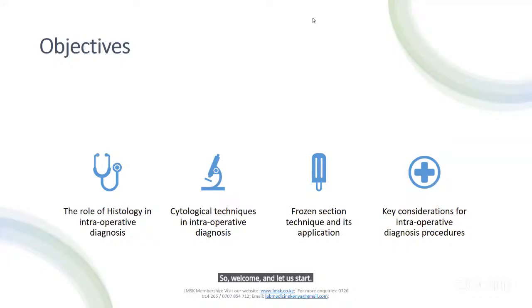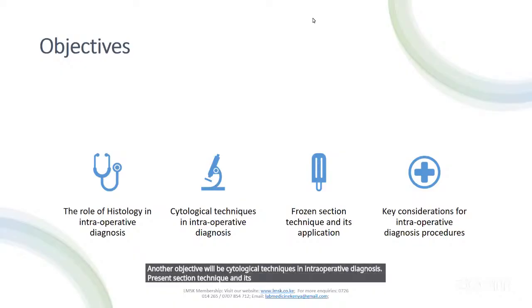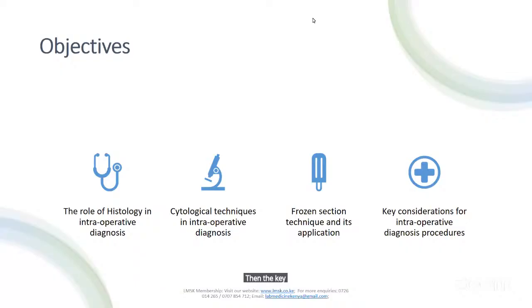So, objectives for the day. Today we are going to look at the role of histology in intraoperative diagnosis. Another objective will be cytological techniques in intraoperative diagnosis, frozen section technique and its application in intraoperative diagnosis. Then the key considerations for intraoperative diagnostic procedures.